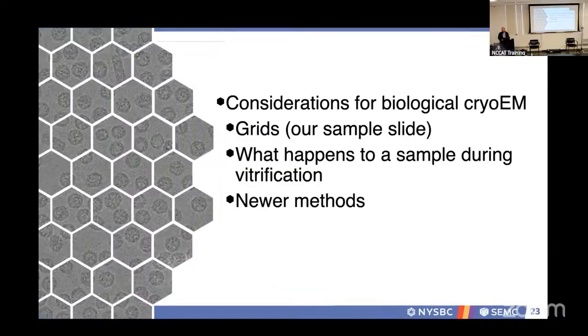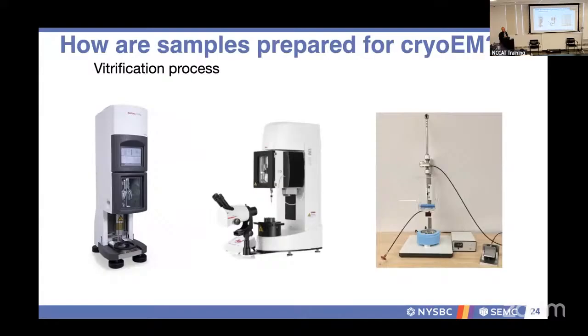Okay, so I'm going to briefly touch upon the vitrification process, and if I have time, on newer methods, but I want to leave you enough time because in about 20 minutes, we're going to be heading downstairs.